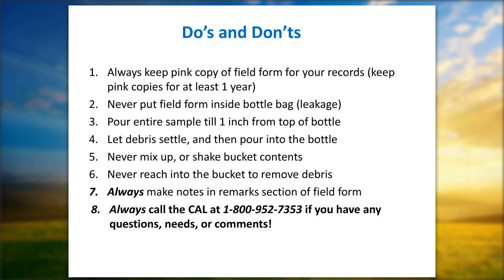When water freezes, it tends to expand. So we do recommend leaving about an inch at the top of a 1-liter bottle to allow a bit of expansion to keep the bottle from cracking if it freezes. Number 4 is important. This is good decanting practice that Jeffrey highlighted at the beginning. Any debris in there, let it settle. Don't attempt to swish it around and get it all there. We really want the leaves and vegetation and the grass to settle out. We just want to decant it, leaving the debris there, and that goes along with number 5.